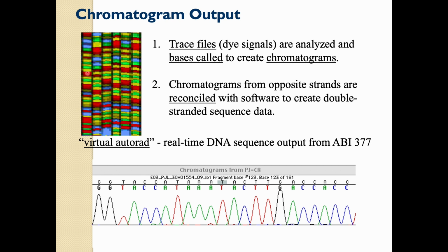These files contain raw signal data of fluorescence dye signals that correspond to each nucleotide incorporated during the sequencing reaction. These are different lanes in different columns. Each lane corresponds to a different sequencing reaction.